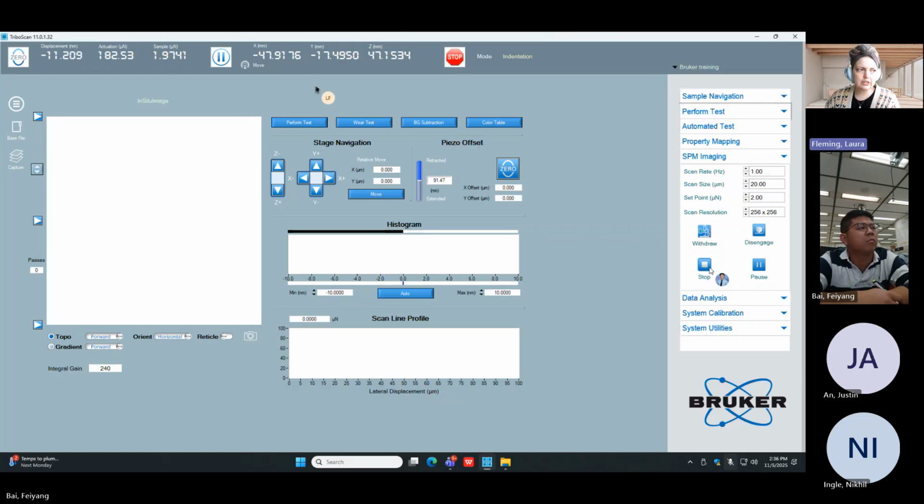While that begins, I would like to talk about how imaging is performed. Because if you recall, one of the things I wanted to talk about was where you get data from, which pieces of the instrument, because in those load displacement curves, all of that data is taken from the transducer itself. Imaging is an interplay between the piezo scanner, so that tube, and the transducer itself.